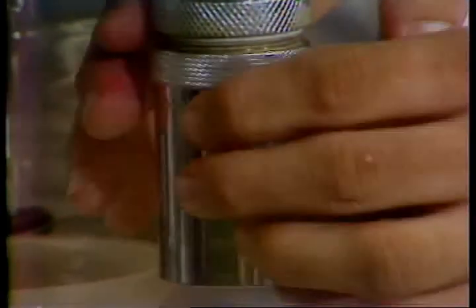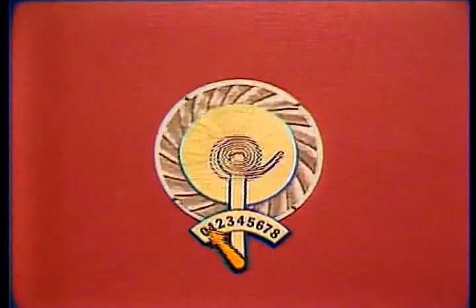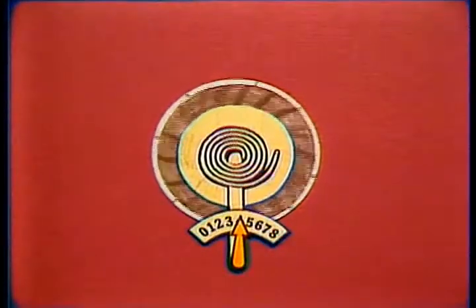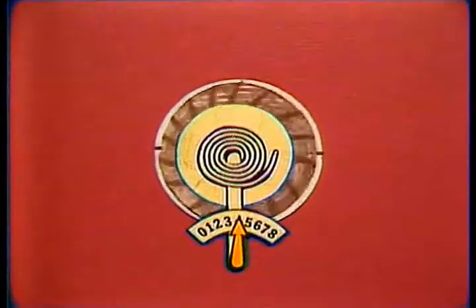Another cylinder is placed around the first one. There's not a lot of space between them. This outer cylinder is turned either by a crank or a motor. As it turns, it doesn't touch the inside cylinder, but whatever liquid is in between the cylinders begins to turn along with the outer one.